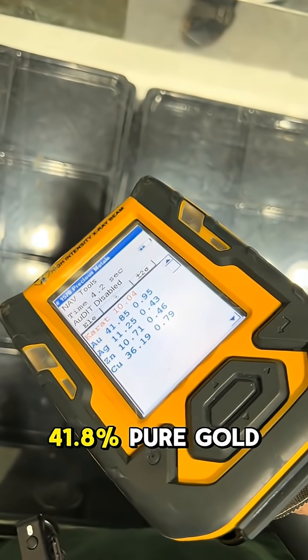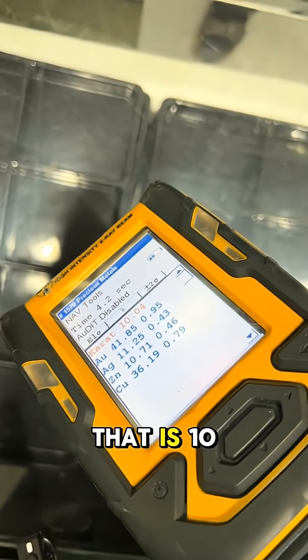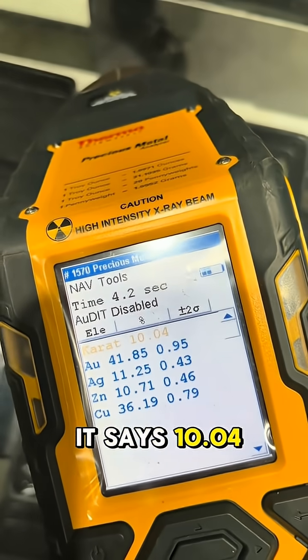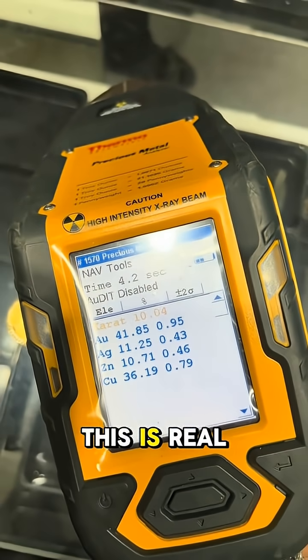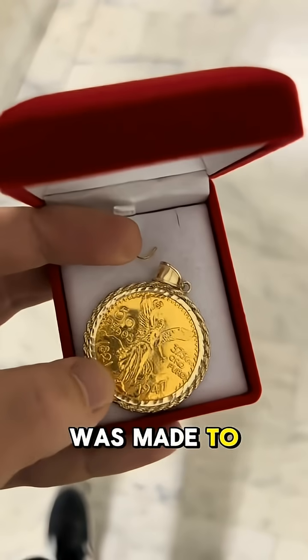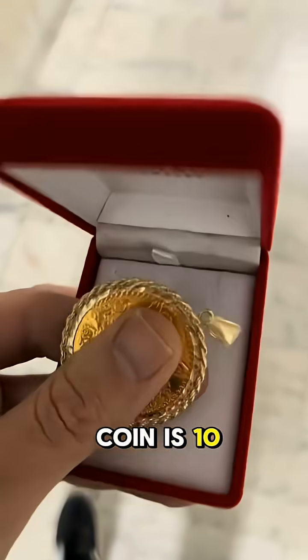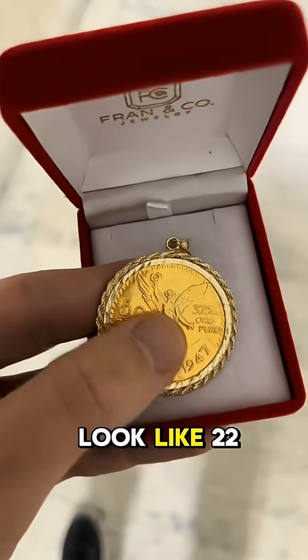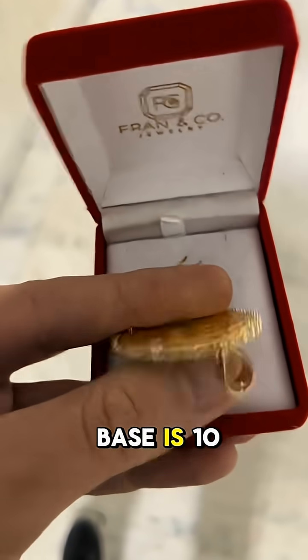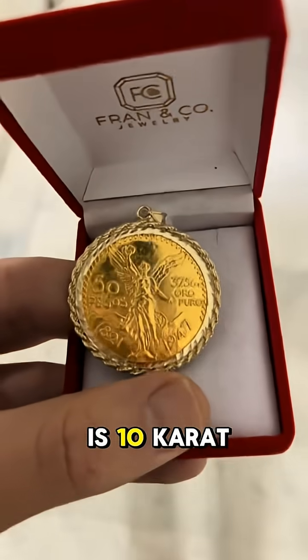41.8% pure gold, and the rest are alloy metals, so that is 10 carat. The top says 10.04 carats, so this is real. Basically, the styling choice was made to make it look like 22 carat, but the base coin is 10 carat as advertised. They made it look like 22 carat, but the base is 10, so it is not gold-plated because the base is 10 carat.